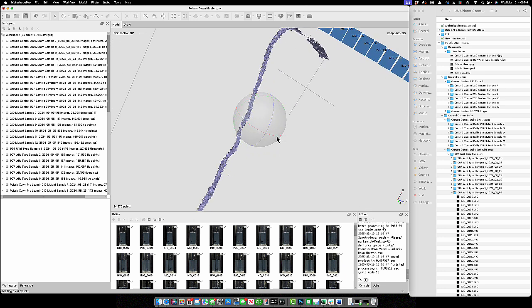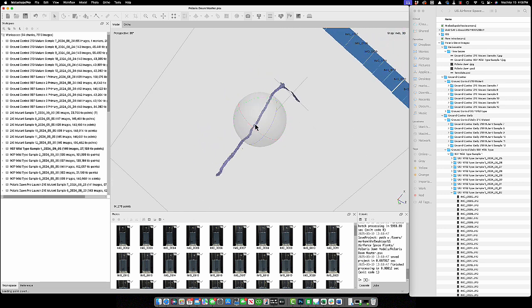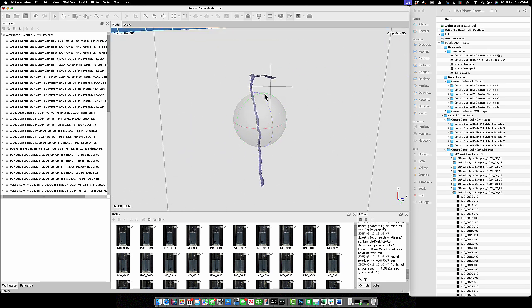So I have a really well-defined point cloud. It follows a pattern in all directions. A lot of times, when you see a plane where it starts to flatten out as you rotate, you can see there's still bends, but generally what's happening is the root is progressing along that interface, and then once it finds the facet of the cuvette, it shoots itself downward in between the aggregate and the plastic of the face. So some have come out really flat, others look very different. That's something we're going to be looking at, answering the question why in time. But for now, just showing you how I generate this point cloud.